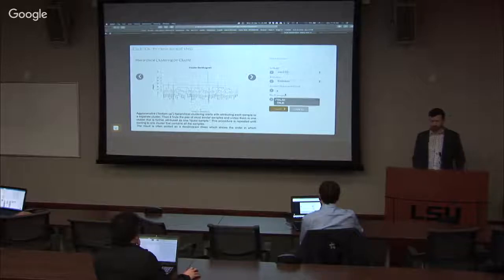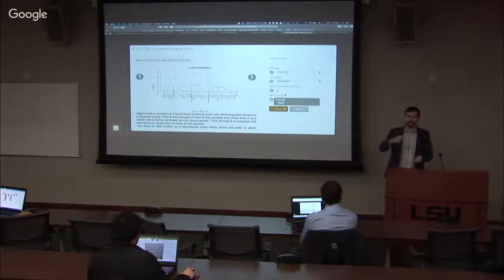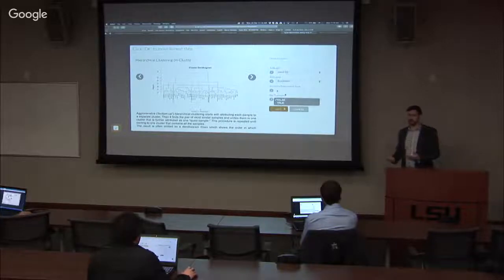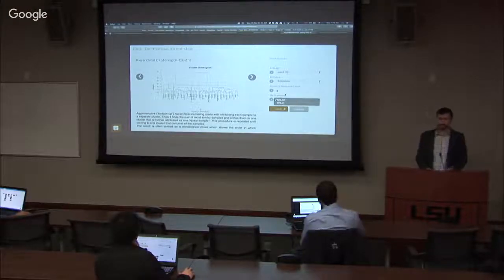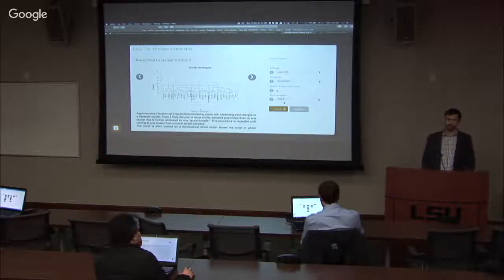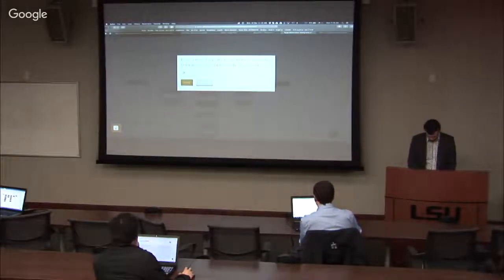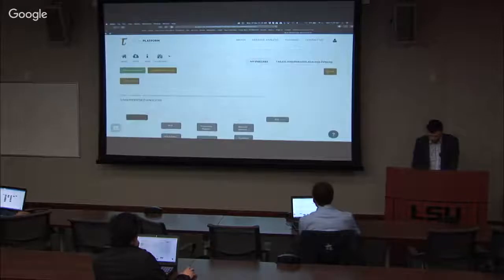Now it does have this option here to transpose or not transpose. Transposing a table means that you flip it to the side, so your rows become columns and your columns become rows. And what is in our rows and columns? Our columns are sample names, right? And our rows are genes. So we can cluster either our genes based on samples, or we can cluster our samples based on genes. So this is the option. In this case, we do need to transpose because we want to look at the difference between our samples and not the genes. And just click on end. This is hierarchical clustering. Run pipeline.